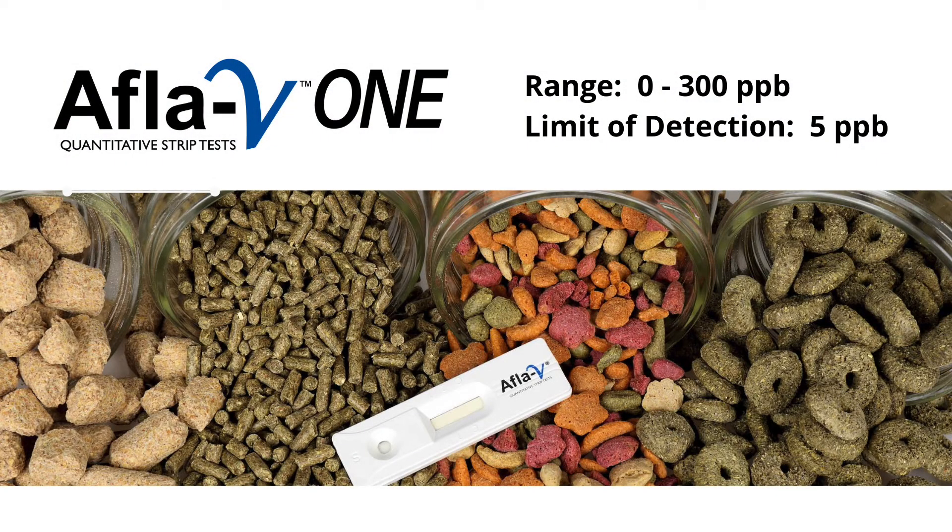Vicam's Afla V1 Lateral Flow Strip Test enables animal feed and pet food operations as well as livestock producers to monitor total aflatoxins in complete feed formulations. The test is designed for field and laboratory use and requires no special training or expertise to obtain accurate results.